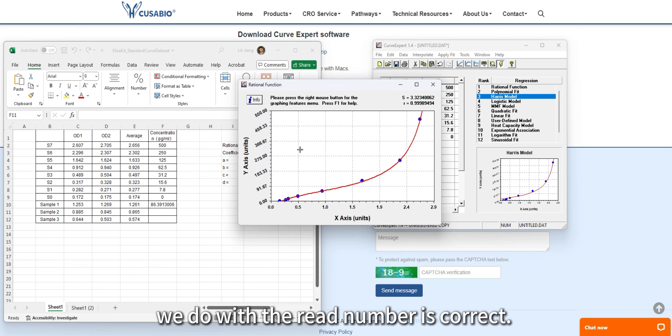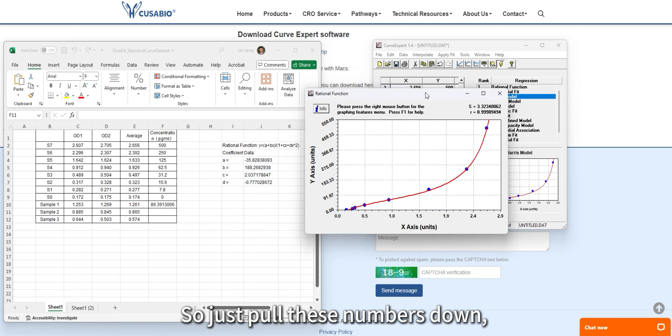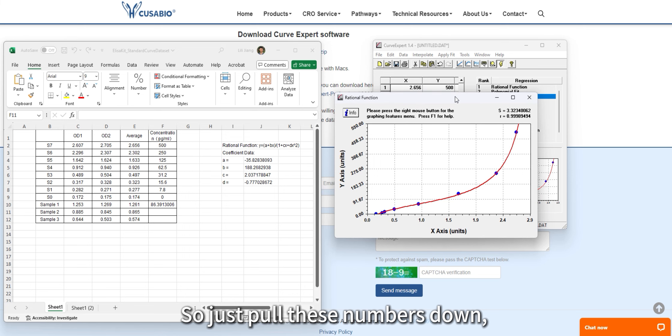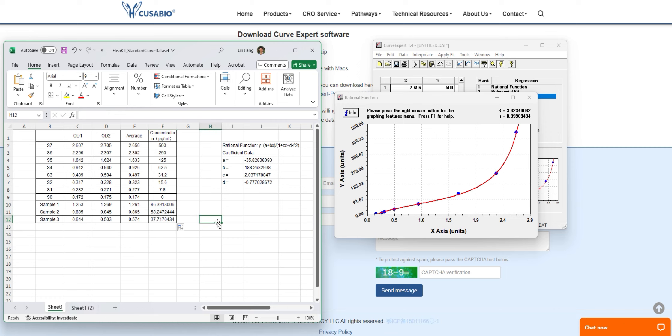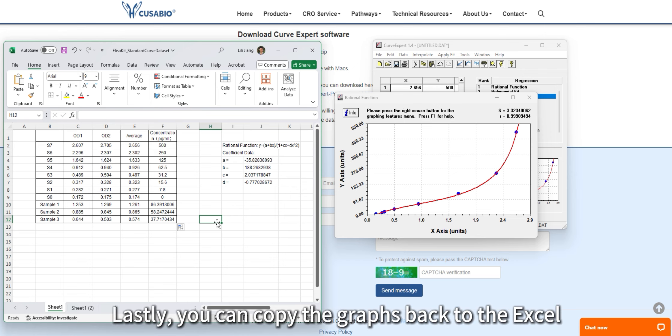Just pull these numbers down and you will have the concentrations of sample two and sample three.